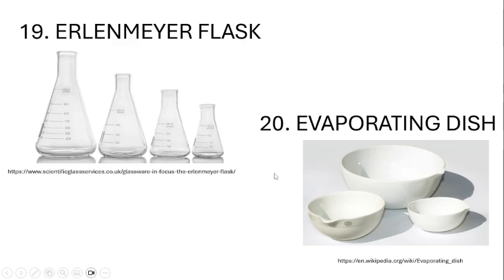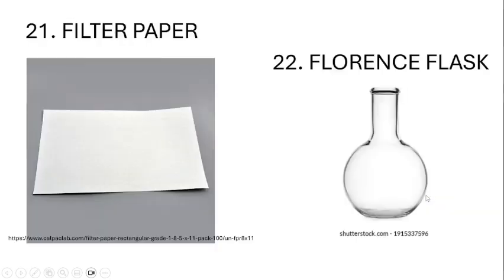Next, we have your evaporating dish. It is used for evaporation if you have a solution with a solute, and if you have a solid precipitate as well, you use the evaporating dish to separate the two. It is made of ceramic and comes in different sizes also.